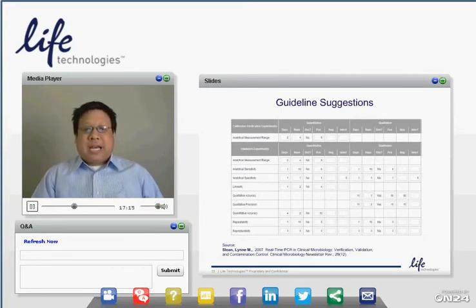So, a little bit of guideline suggestion again. This is a snapshot of what I showed you earlier from Lynn Sloan's paper. This is our interpretation of what that paper referred to. And what you can see is the number of days, replicates, and positive and negative levels required for each one of these experiments, like analytical sensitivity and quantitative accuracy.